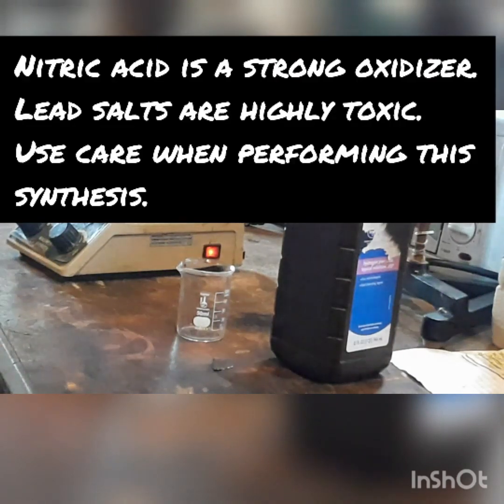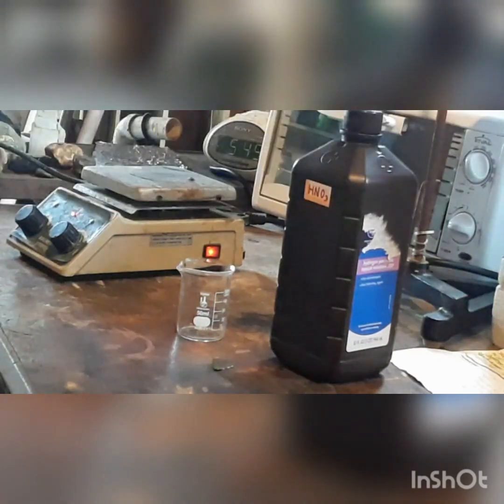Hey guys, welcome back here to Chaos Town. We are going to do another video here today and this is a relatively simple reaction. We are going to be making lead nitrate.